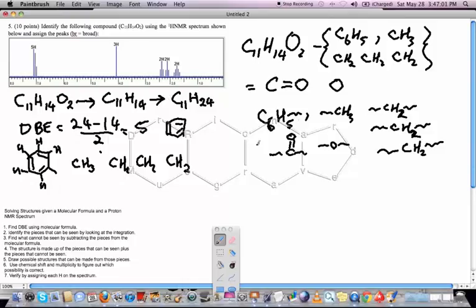Now what I want to do is, instead of just going ahead and drawing some structures, I want to try and see if we can figure out what we've got based on a little bit of logic. Now we've got a CH3 here that's a single peak. That indicates that CH3 is likely to be next to something that doesn't have any hydrogens on it because one peak means 0 adjacent hydrogens. Remember the rule is this, n peaks, n minus 1 adjacent hydrogens on carbon atoms. So what that means is 1 peak, 0 hydrogens on adjacent carbons. So what I'm going to do is I'm going to take a flyer here and I'm going to say that the CH3 is next to the C double bond O. It really couldn't be next to anything else. If it was next to the C6H5, that would cut out everything else that's in the spectrum. So the CH3 must be next to the C double bond O.